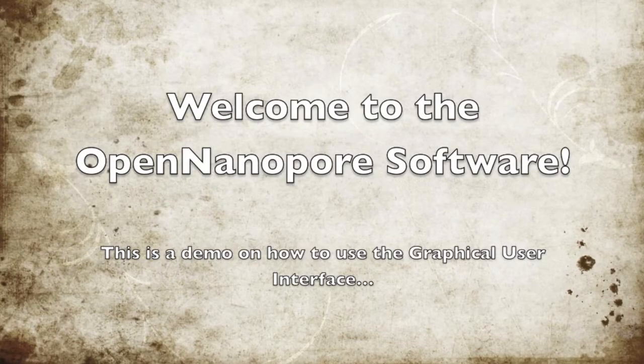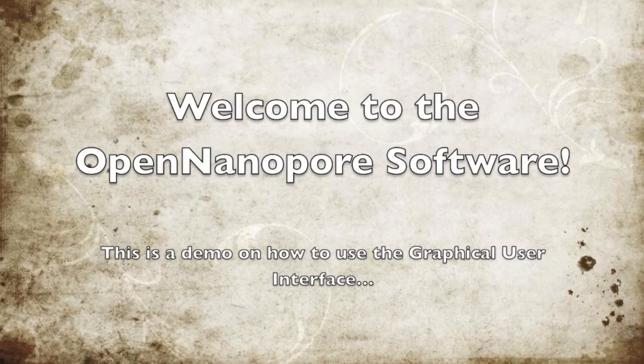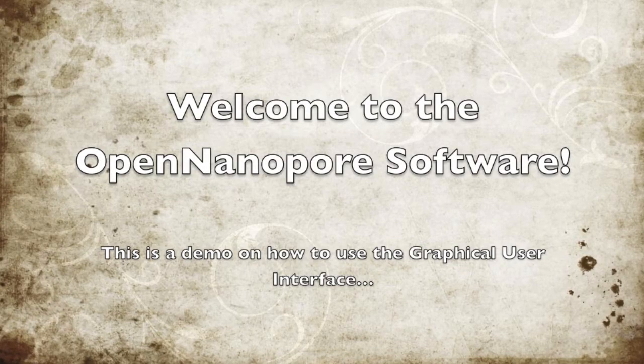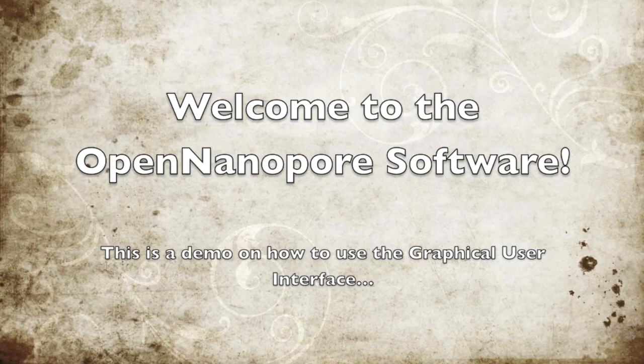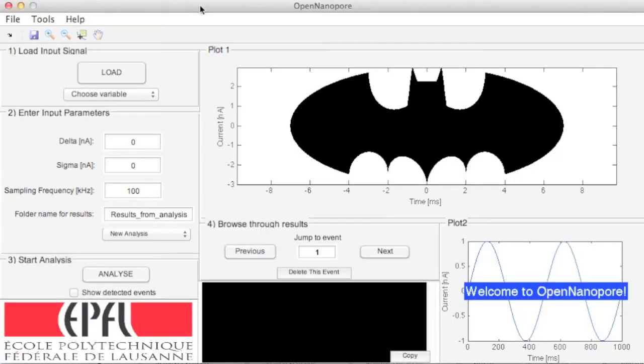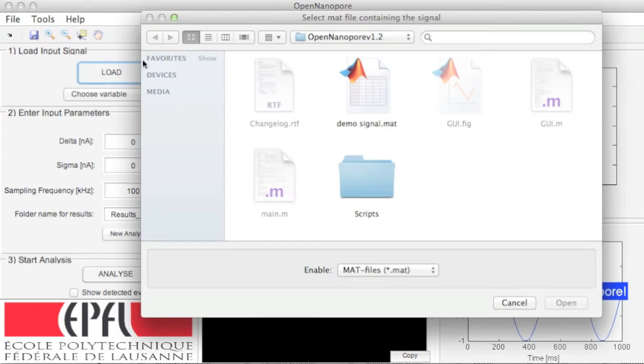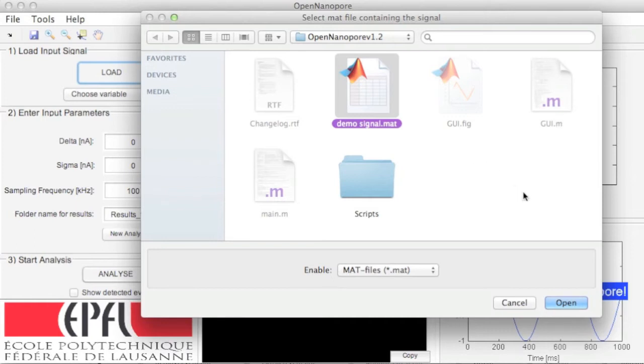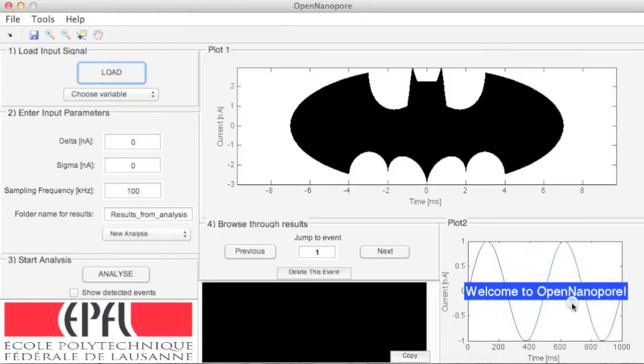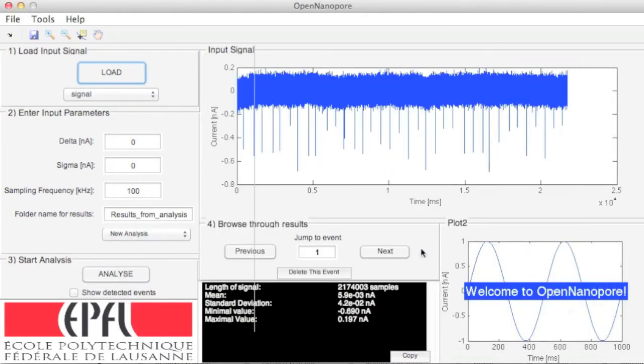Welcome to the OpenNanopore software. First, load your signal. The OpenNanopore software takes .mat files only. You need to have pre-saved your signal in MATLAB format. Wait for the signal to load in the top right window where you can visualize it.